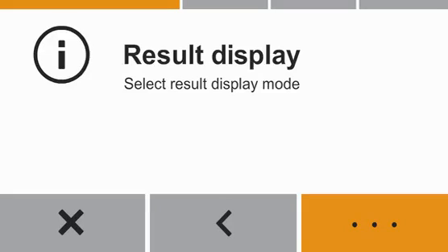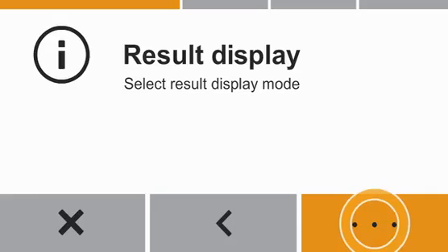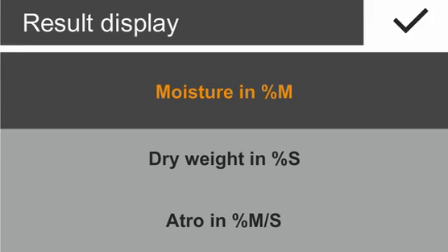Please select in the window result display how the result of the moisture analysis should be displayed. In our example, we select Moisture Content in Percentage, Percent M.